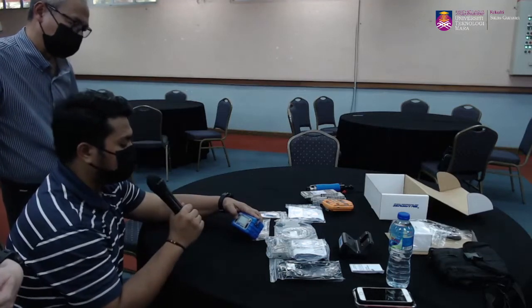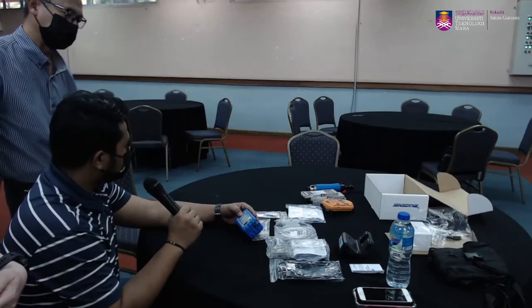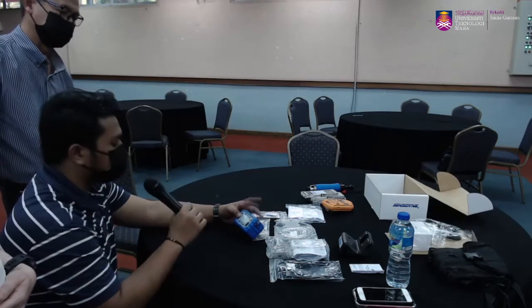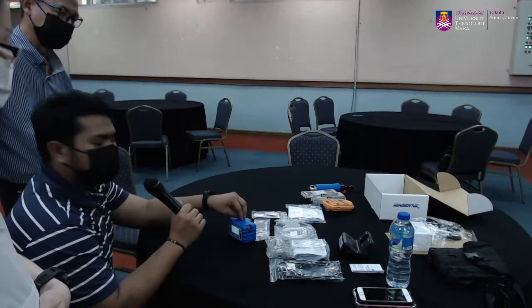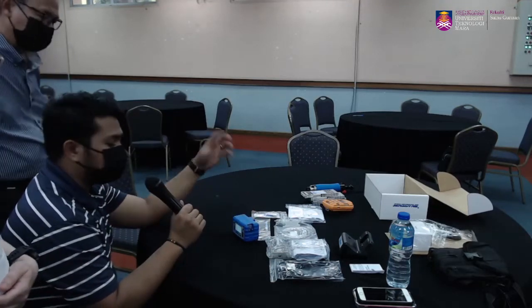Alright. Bila kita dah setting tadi flow rate tu, kita nanti dia hilang ke dalam tu ke ataupun kita kena setting balik? Kalau kita dah tutup. Kita dah tutup. Kalau kita dah tutup nanti dia akan maintain the last setting yang kita dah buat lah. Sebab dalam unit yang ni is the most advanced which dia ada data logging juga. So kalau ada data logging, usually-nya dia akan save lah last parameters yang kita dah set tu lah.